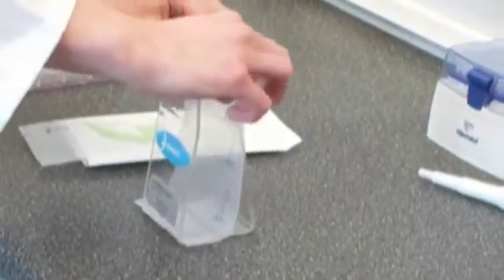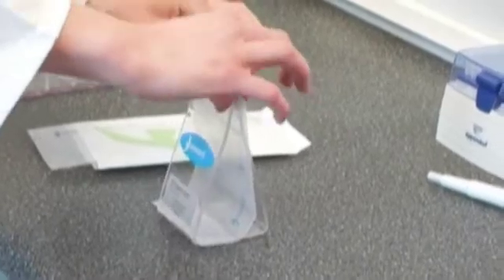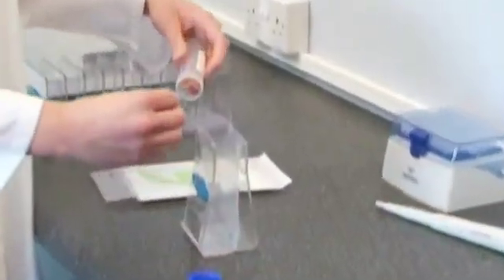The Stomacher 80 Biomaster is ideal for small samples and tissue processing. It is capable of processing samples from 5 to 80 milliliters.